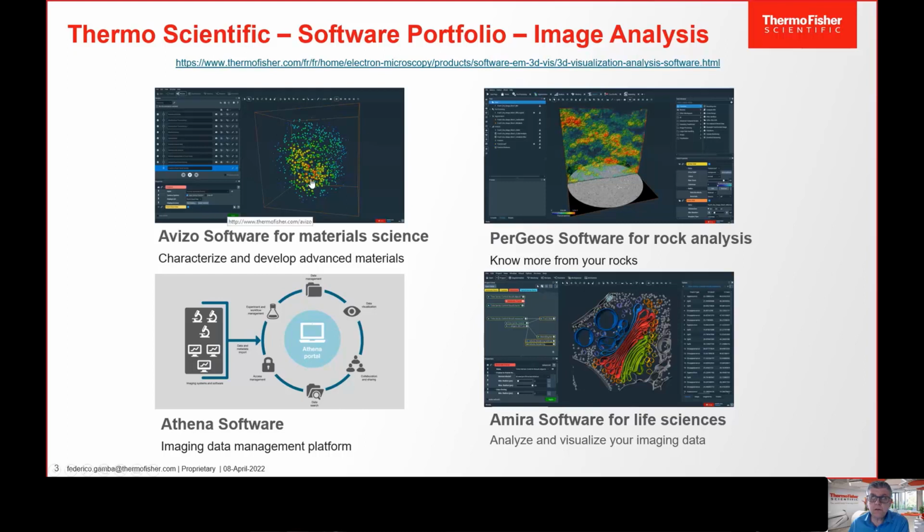It's not targeting a specific material, so it's quite broad and is designed to be very flexible and generic for research on any material. Indeed, any material, then if you look at the real usage, it's usually like a composite or porous media or fiber media, so the fiber material, sorry. Yeah, so that's usually the kind of material that gets analyzed.